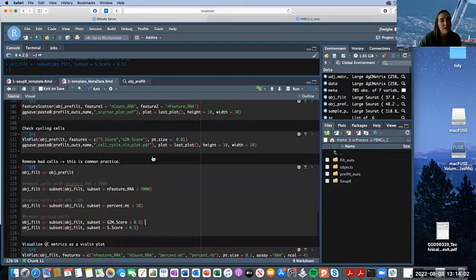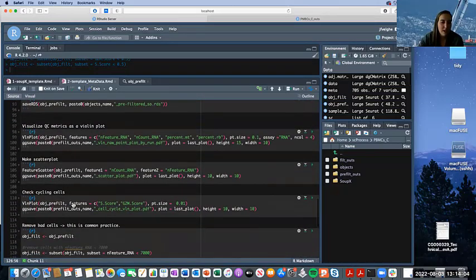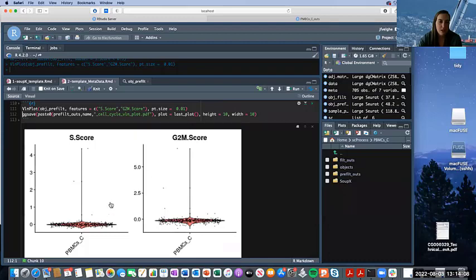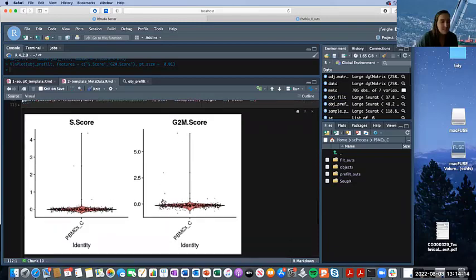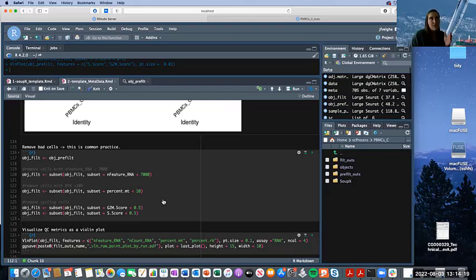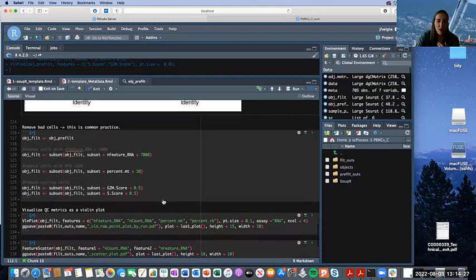These filters were based on the plots we were looking at. Yeah. So if we go and look at the pre-filtered one here, you can see that there are just a few cells that are potentially in the cell cycle. And categorizing those cells as being in the cell cycle is based on a large list of genes that are upregulated when cells are cycling.